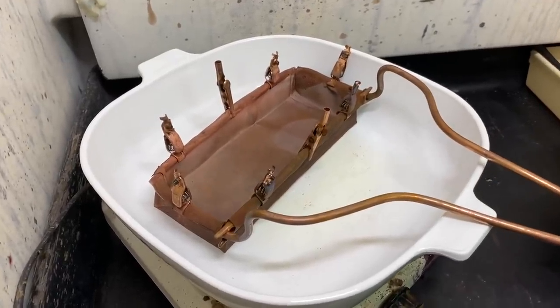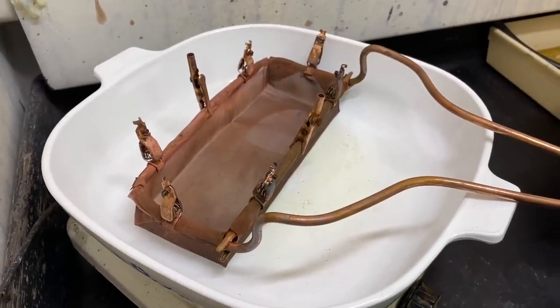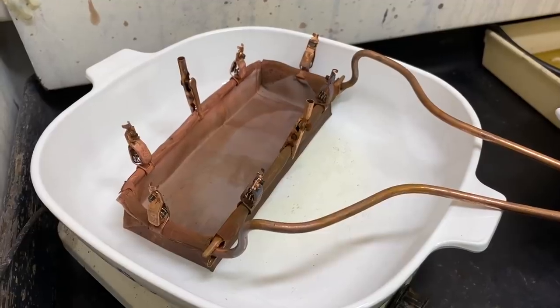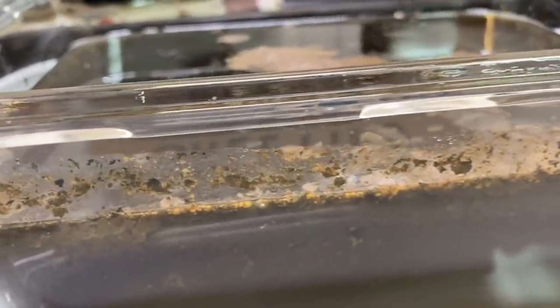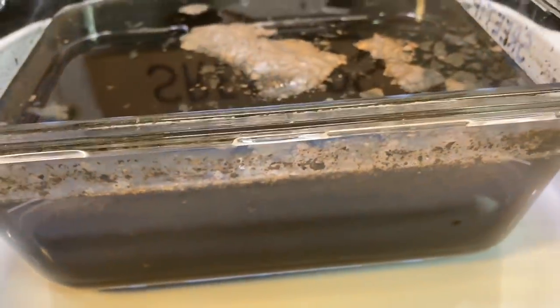Alright, this is the fifth day of the experiment and I'm drying out the anode basket. I've opened the cell back up — take a look at this thing. We've got a layer forming in there. There's some sediment down at the very bottom and the black powder is starting to settle out of the liquid.